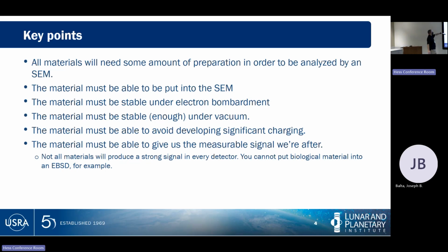We're going to have to spend a lot of time avoiding significant charging because this will affect any analysis that we try to do. And whatever the signal is that we're after, we must be able to get that signal out of there. Not every material will produce a strong response in every detector. Organic and biological materials would be a bad use in an EBSD or an EDS because we're not going to get a signal out of it.